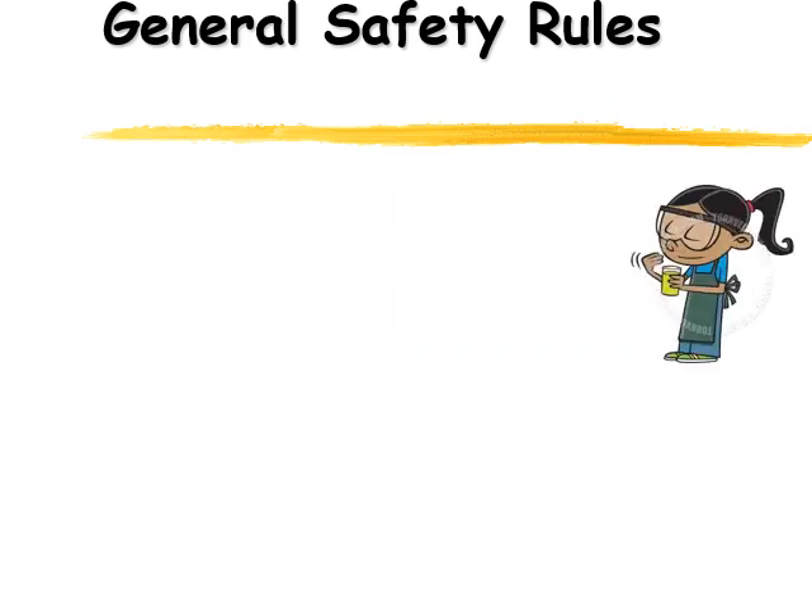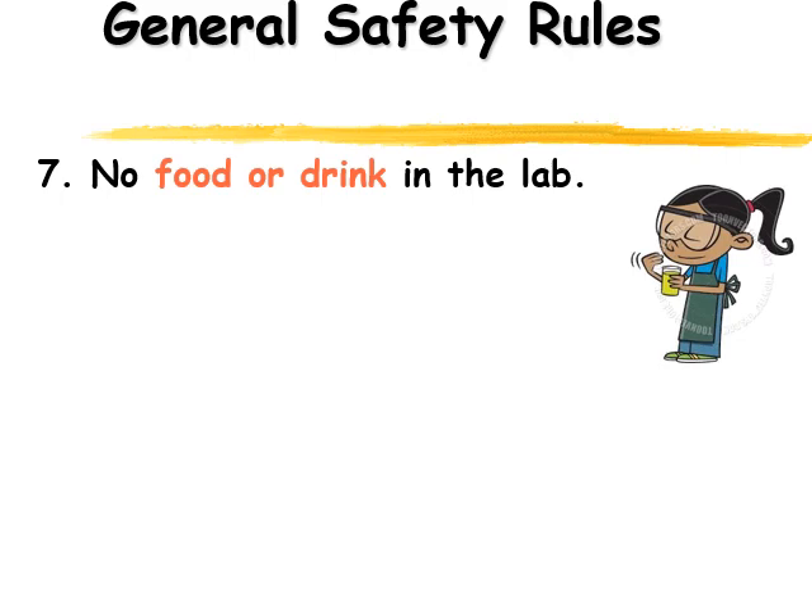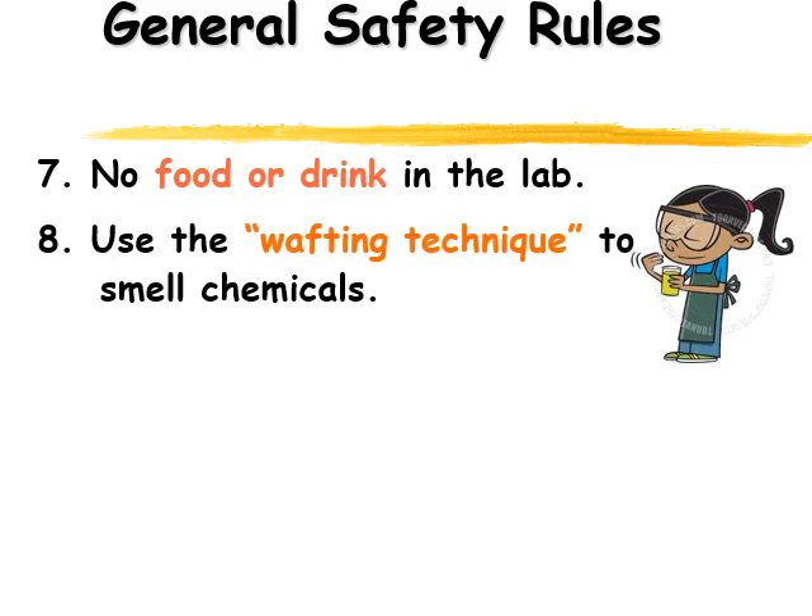To keep you safe, there's going to be no food or drink in the lab. We don't want food or drink getting mixed with dangerous chemicals and then you ingesting them. If you need to smell something, you need to get the odor of something — we're going to use the wafting technique. You can see in the picture the girl is waving the fumes towards her nose rather than sticking her nose right into the beaker. So if you need to smell something, use the wafting technique.